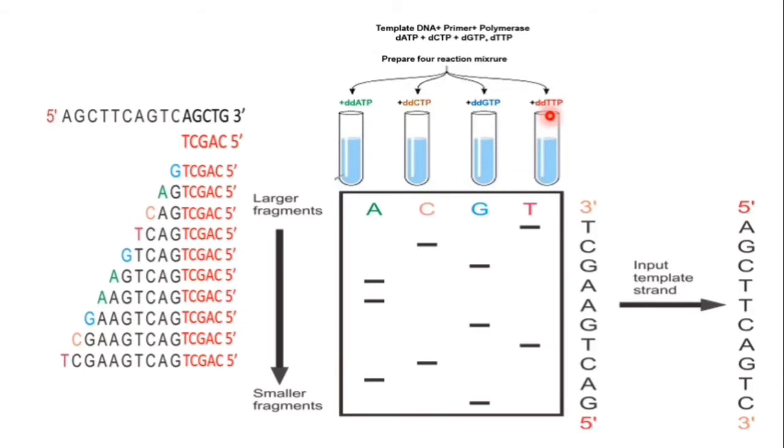You have to remember that when you are adding ddNTPs, that is dideoxynucleotide triphosphates, their concentration should be less compared to our normal dNTPs.